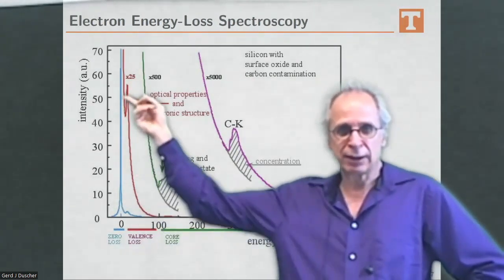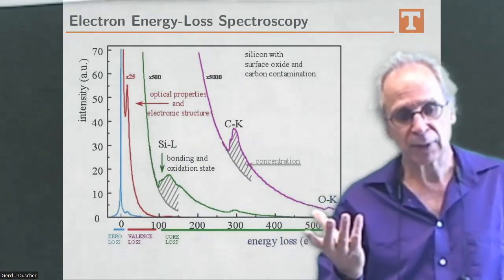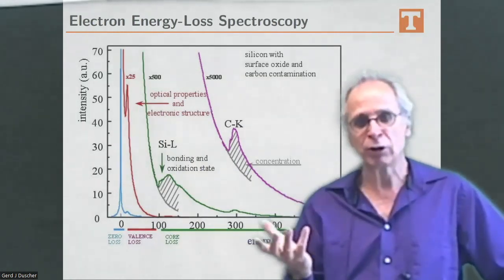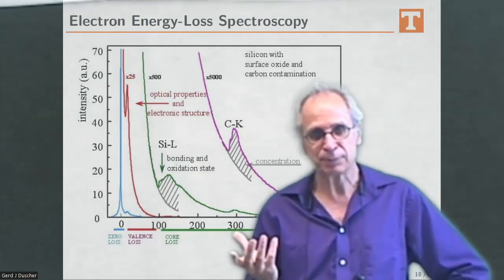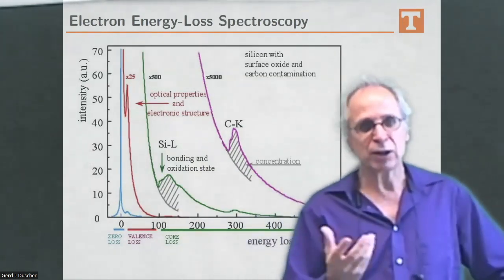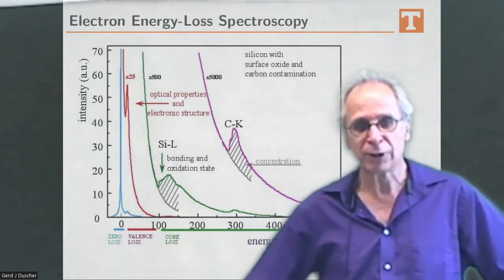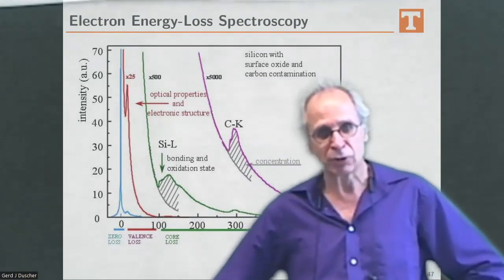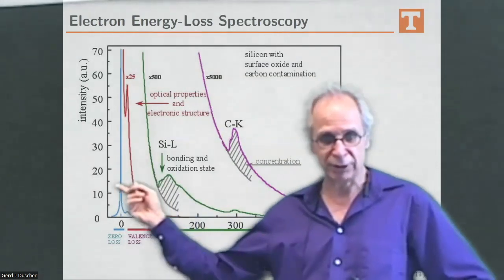And that are all the electrons that are not scattered at all, have no interaction with the sample, or are elastically scattered. And depending on your energy resolution, so if we are talking about a normal microscope with up to 100 millielectronvolt resolution, then also the phonon scattering is in here.